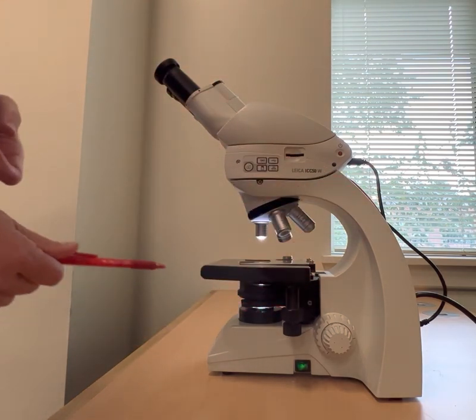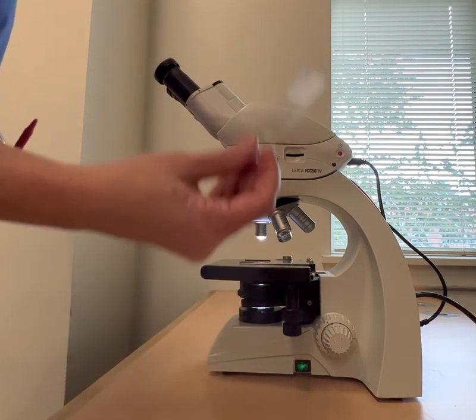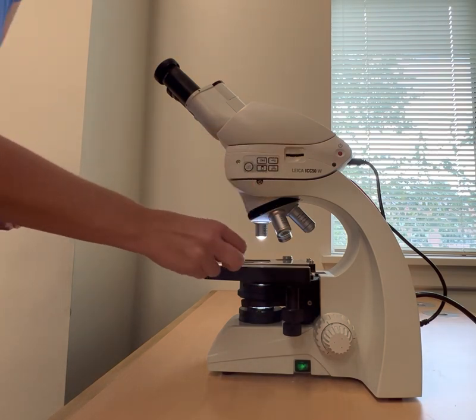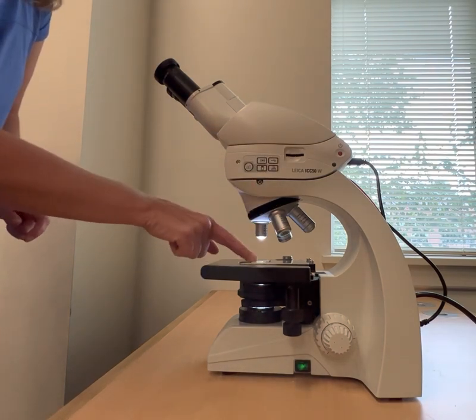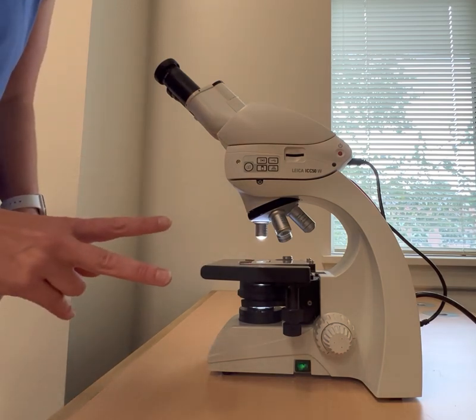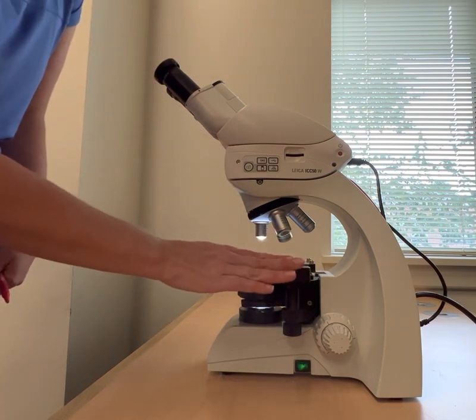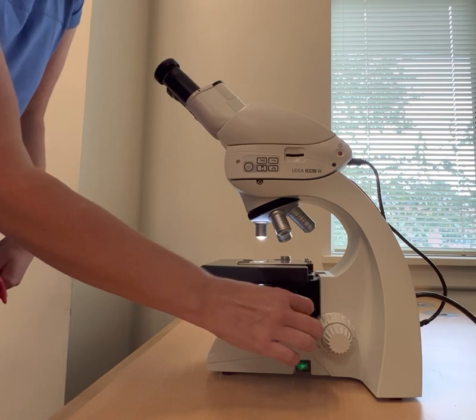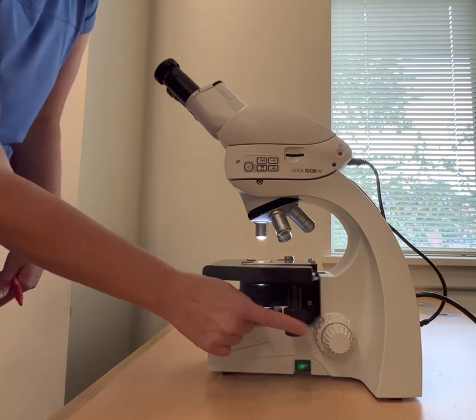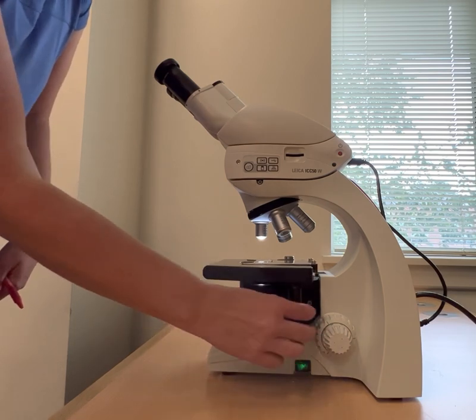We are going to come down, and this is going to be our mechanical stage right here. So if I had something I wanted to look at, so I've got my slide with the letter E, I'll put it on the mechanical stage, put it between my stage clips right here, and then you can move it. So there are two things that you need to know on how to move things on your microscope. One thing is, here's the mechanical stage. I can move the stage forwards and backwards and side to side using these. These are the mechanical stage knobs. Again, forwards, backwards, side to side using them.